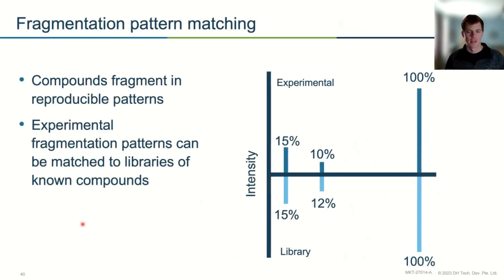So you saw on that previous slide with the different fish, that fragmentation pattern is specific to PFAS, and it can be used to identify PFAS. Similar to our isotope ratio, we would have a ratio that we would see in our sample of the parent fragment to all its fragments. That should match, if we've created a library with a standard of that compound, to a pretty strong degree, especially if it was run in the exact same conditions, the library spectrum. So this fragmentation pattern, again, is something else we can do in high res that gives that extra degree of confidence when you're making an identification.